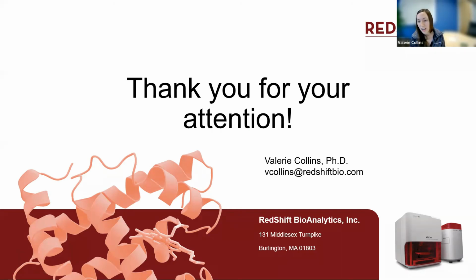All right, so I see in chat, the first question is, did you encounter protein instability and aggregation in these samples? Good question. With the samples at higher concentrations, we may have seen this, but we were operating at pretty low concentrations to try and mitigate how much aggregation we have. One thing to note is that this is a flow system, so we want to avoid clogging our flow cell with aggregates. If we do see precipitates, we can do things like centrifuging to get rid of the larger aggregates, or filtering.